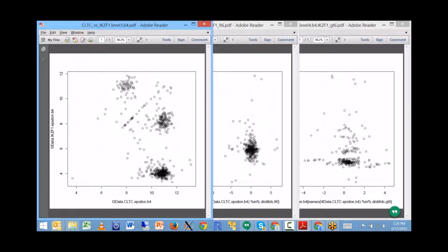But this one, the y-axis, shifts a lot between these two clusters and this third cluster. So basically, my hypothesis is that this gene overall is low expressed, and often it's below the detection limit, at least in this bead batch.